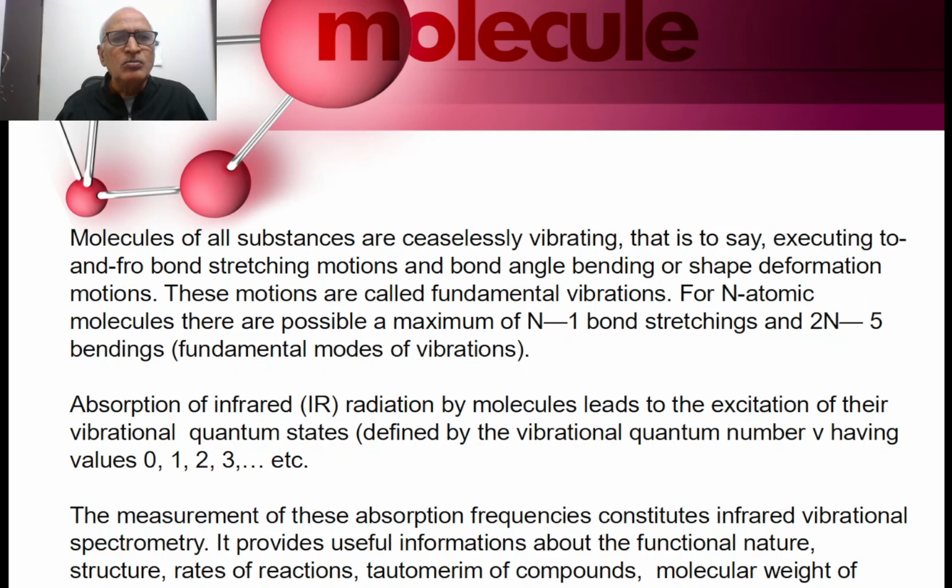As we know, molecules of all substances in all physical phases are ceaselessly vibrating, that is to say, executing to and fro bond stretching motions and bond angle bending or shape deformation motions. These motions are called fundamental vibrations. If a molecule has n atoms in it, so for n atomic molecules, there are a possible maximum of n minus 1 bond stretching and 2n minus 5 bond bending fundamental modes of vibrations.